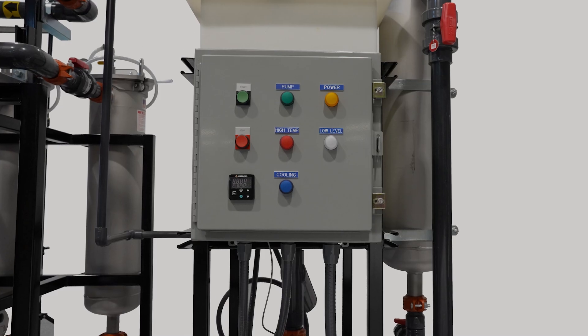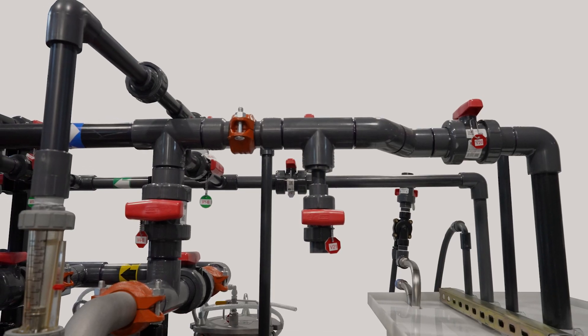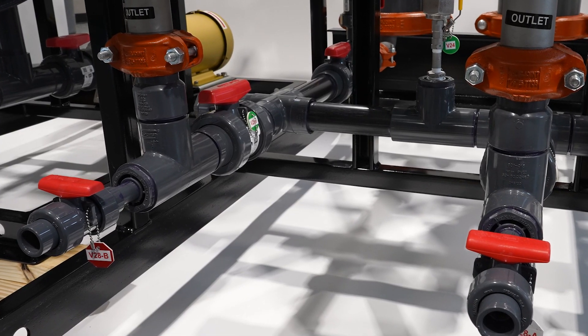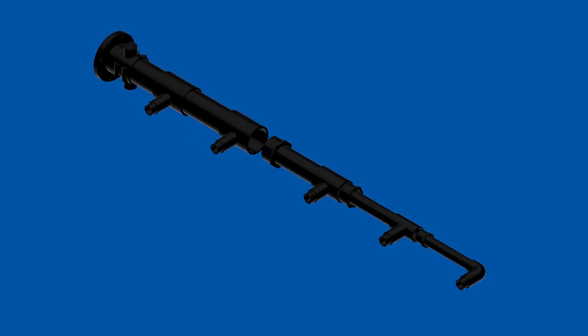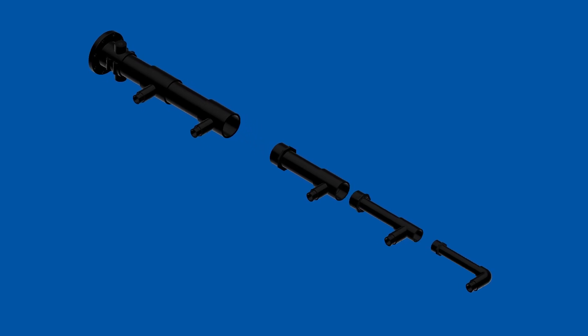TruFlux is custom engineered. Bag filters, clean-in-place systems, and PVC or 304 stainless steel manifolds are available to meet customer preferences. TruFlux provides a well-balanced paint flow thanks to its tapered manifolds that range between 1.5 to 6 inch diameters depending on system size.